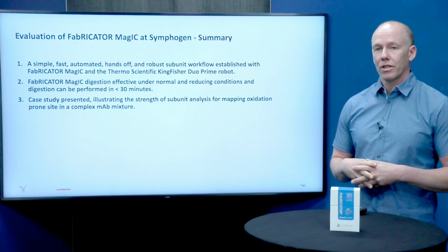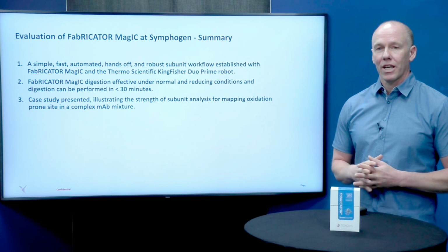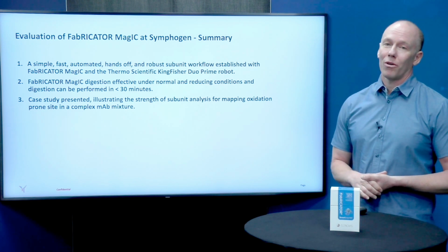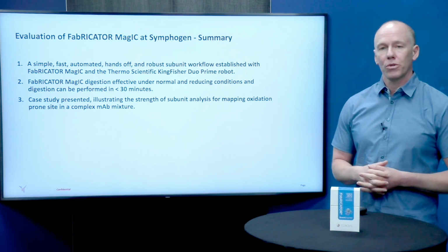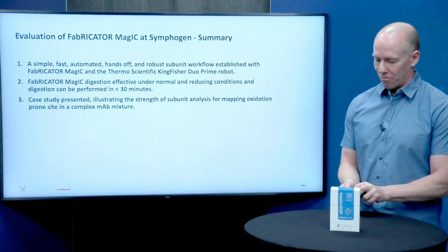So it's short analysis time, it's fast, and it's hands-off. And I showed you some examples of how we were able to map out modifications using this subunit and reduced subunit approach. And I think that's it for me.